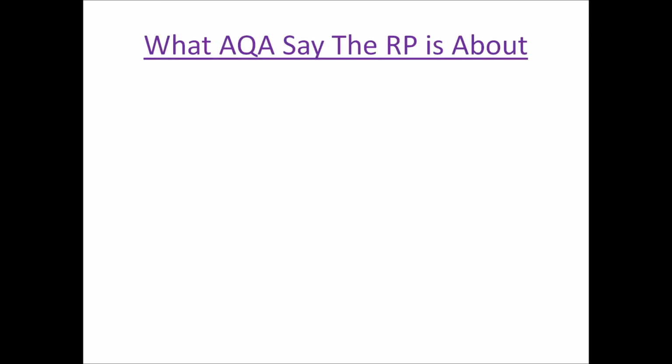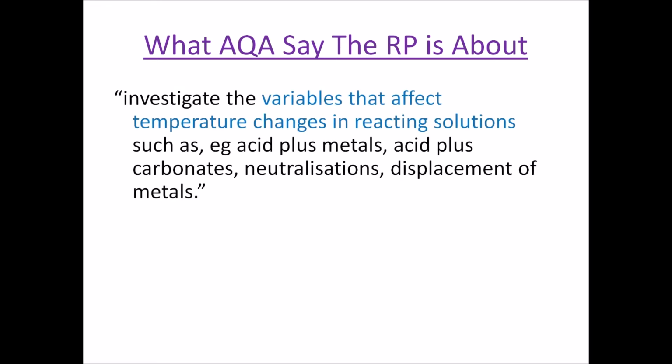Now what they say the required practical is about is that you've got to investigate the variables that affect temperature changes in reacting solutions, such as you might have an acid plus metals and then you're going to get a temperature change. Acid plus carbonates, you're going to get a temperature change in that reaction. Neutralization reactions or displacement of metals.